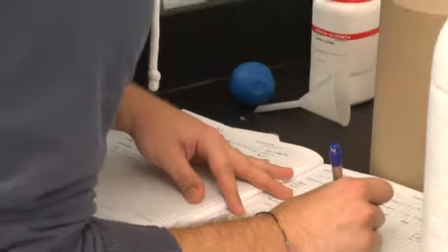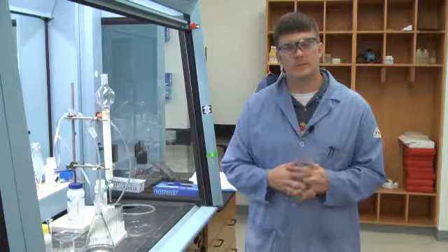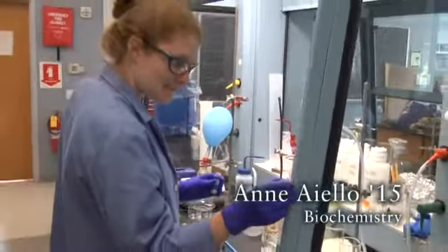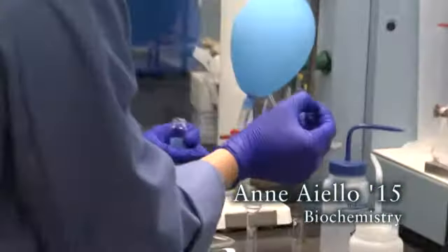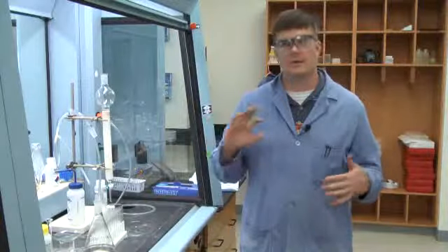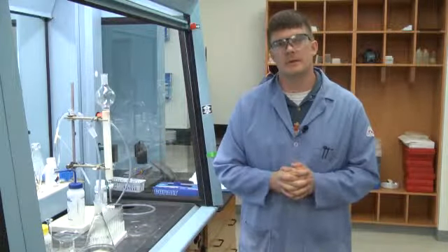A lot of what they're learning in the summer here is really how to be a functional chemist, how to set up these reactions, how to think about when things go wrong. I set up a game plan for both of them at the beginning of the summer and we're already off into new directions and trying to do some problem solving.